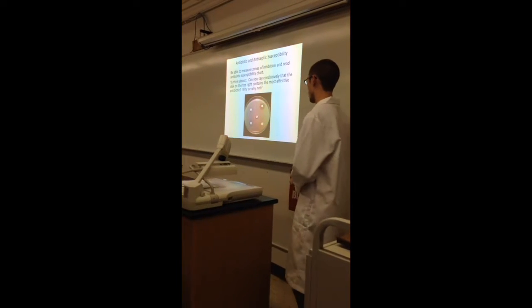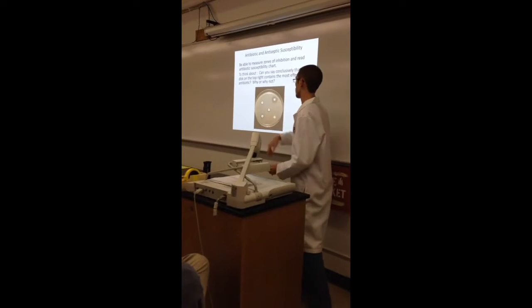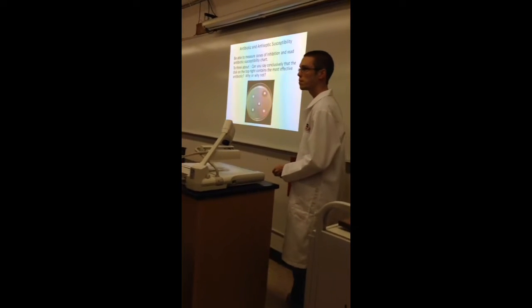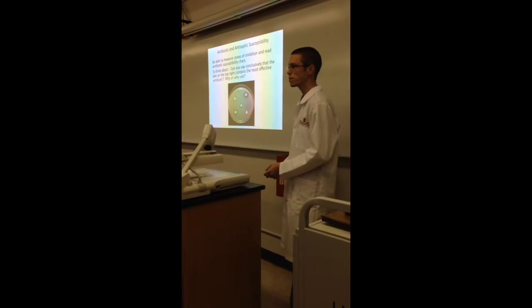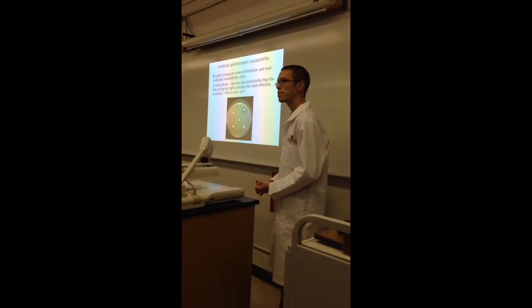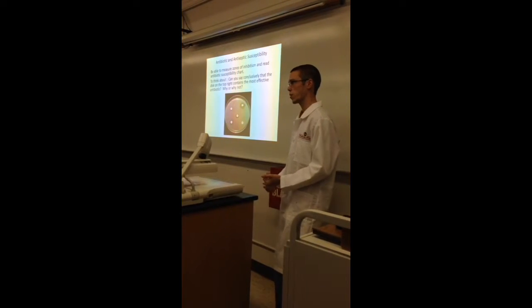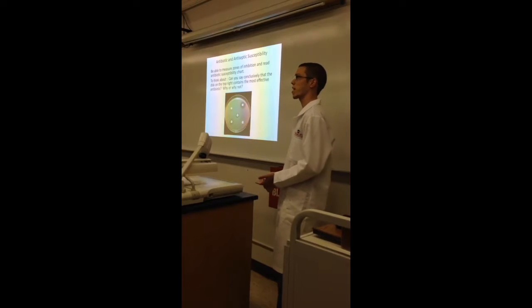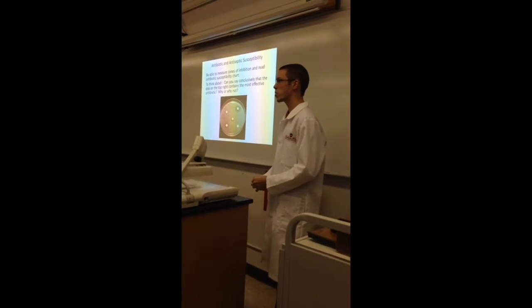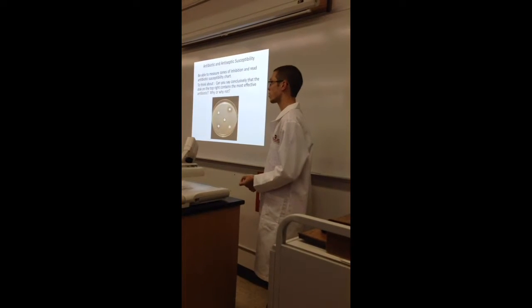And just as another thought question, if you look at all these different zones of inhibition here, we can see that this is the largest zone of inhibition, but does that mean that it's the most effective antibiotic, and why or why not? So the biggest zone of inhibition does mean that there was the most bacterial killing, or if it's bacteriostatic, then it stopped the most bacterial growth for the longest distance. But what detail are we missing about the plate and the discs on it that would lead you to whether or not this was the most effective?